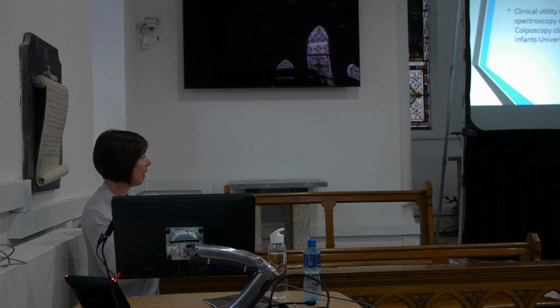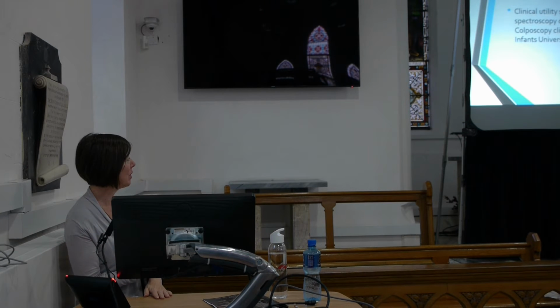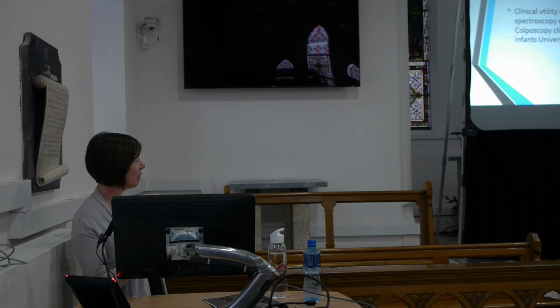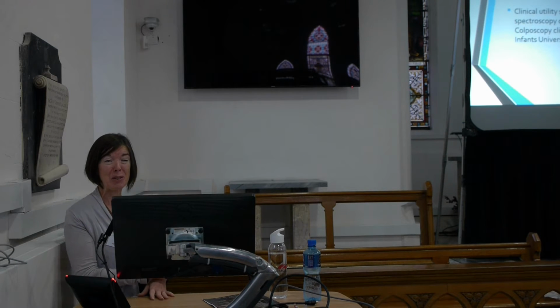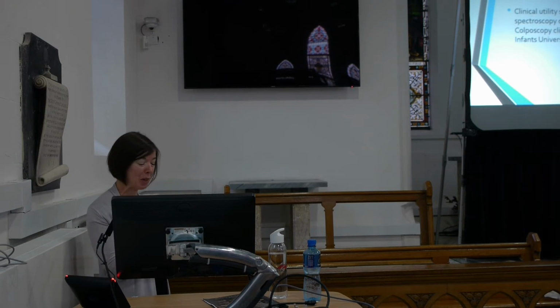So in this application on cervical cancer, our ongoing work is a clinical utility study of Raman spectroscopy on 1,000 patients attending a colposcopy clinic at the Coombe Women and Infants University Hospital. This work is funded by the Health Research Board. We're about a third of the way through the study at the moment, so hopefully we'll be able to report on it sometime next year.